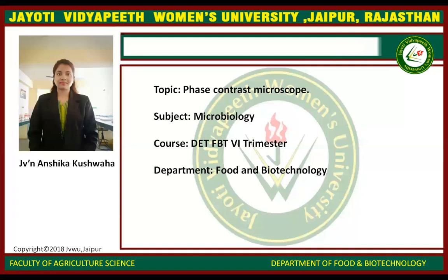So what is the working principle of phase contrast microscope? Regions of different compositions are likely to have different refractive indices. Normally, such differences cannot be detected by our eyes. However, PCM converts these differences into differences in intensity which are visible to the eye. PCM converts invisible small phase changes caused by the cell component into visible intensity changes.